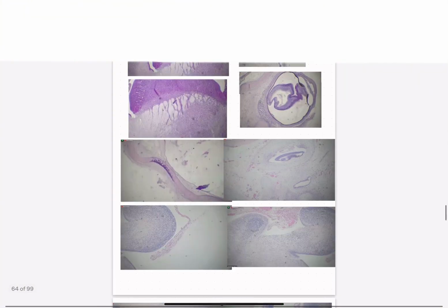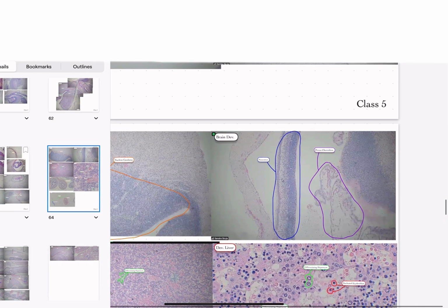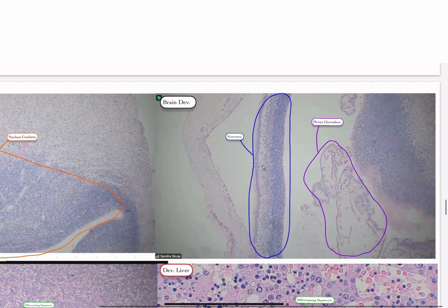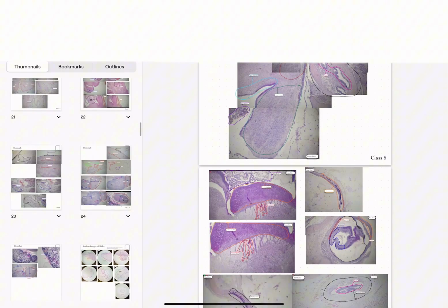Let's look at other areas if we can find it here. Perfect, the neocortex next to the plexus choroideus. So in that case, I'm guessing this could be the nucleus caudatus, unless I'm wrong. Let's carry on to the next slide, and I would like us to talk about the cerebellum.